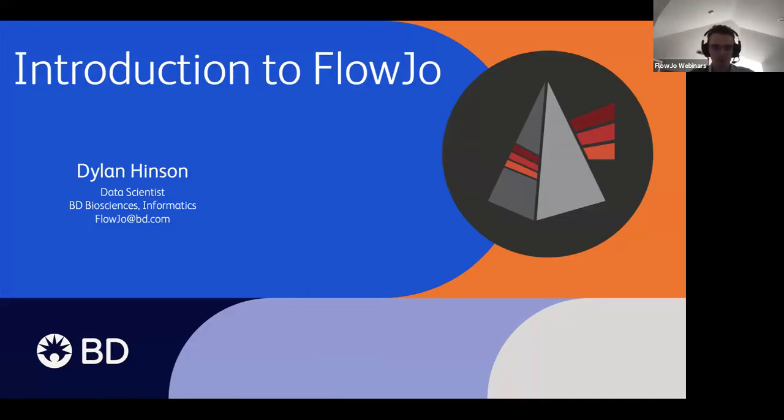All right, my clock says it's 4 o'clock, so I'll go ahead and get started. Hello everyone, I'm Dylan Hinson. Today we're going to be doing an Intro to FlowJo webinar. If you're new to using FlowJo, this is a good place to start. I'll go along through some slides, and then repeat it again doing a live demonstration.